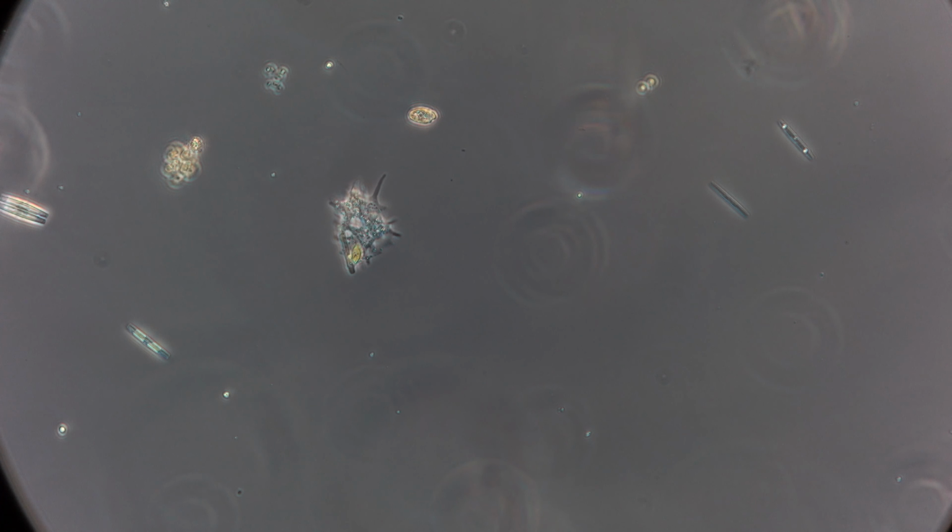Let me make another slide. That one I haven't looked at in a long time. I'll have a look at it. I'm curious to see if anything is alive in there. There may be nothing alive in there, but I'm just curious.